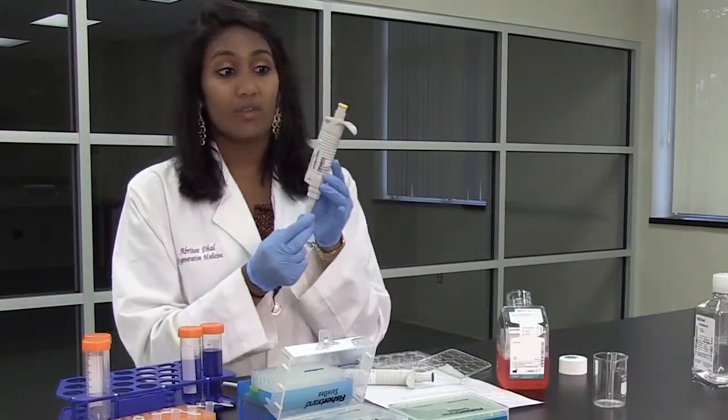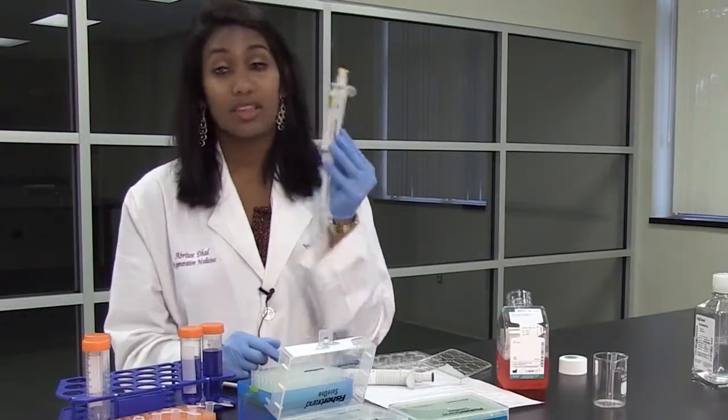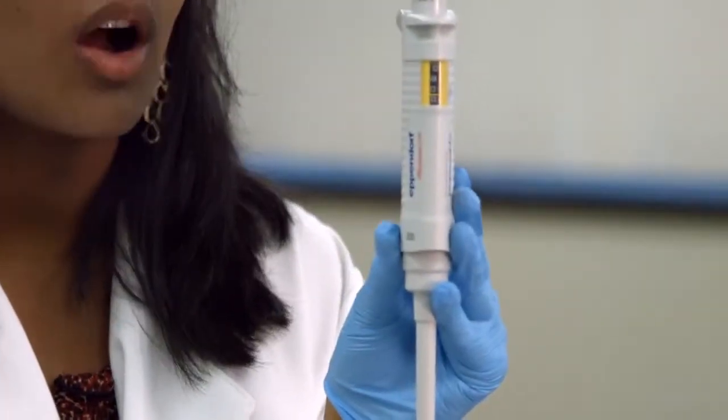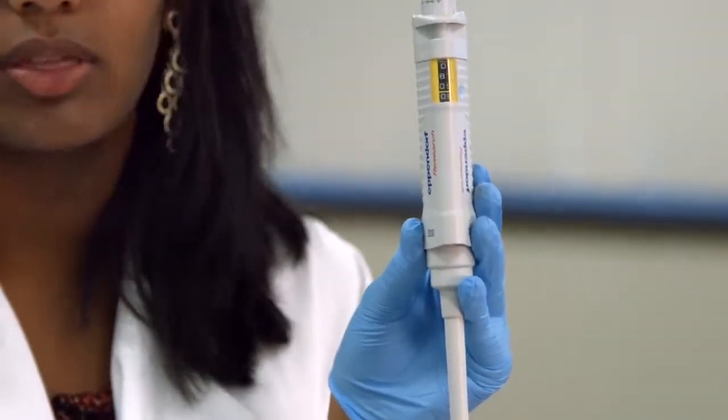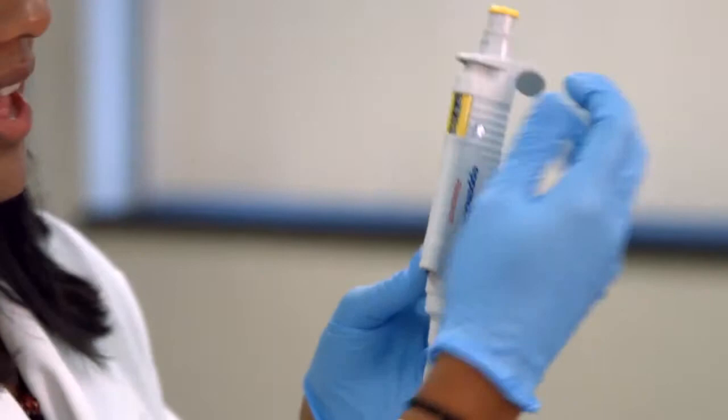So on the P200, if we want to do 80 microliters, this is what 80 microliters look like. But on the P200, you can also do 80.5, 80.3, 80.2, and that's this bottom.